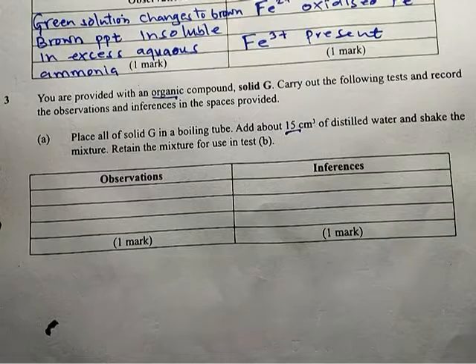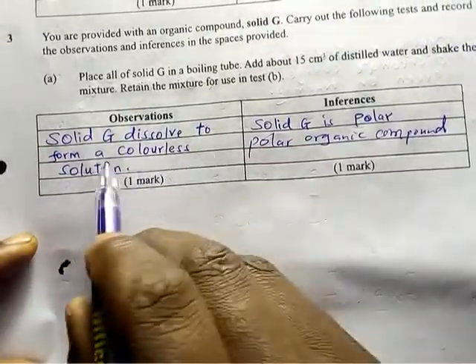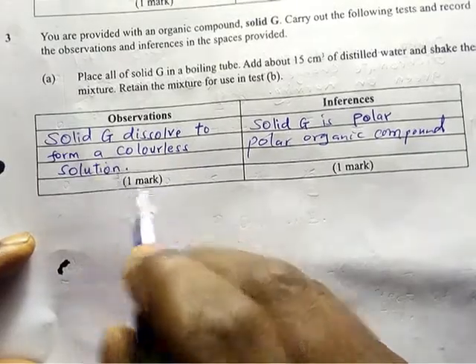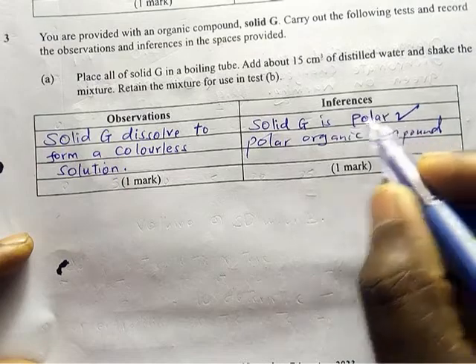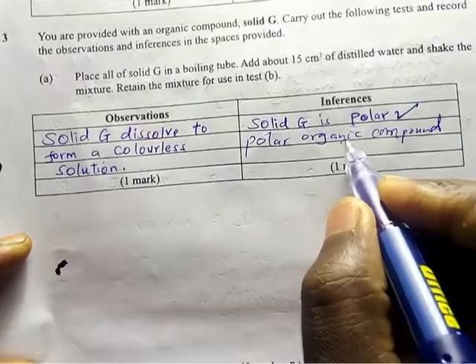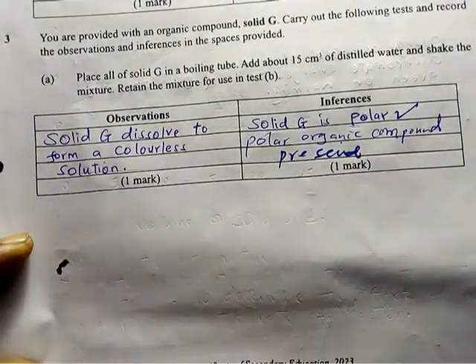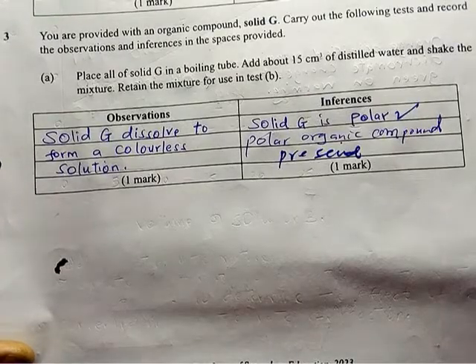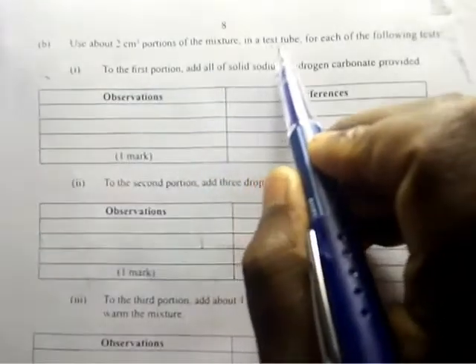Did the solid dissolve or did it not? You need to tell whether the solid dissolved or didn't. In this case, solid G dissolves to form a colorless solution. If it does that, you should know that the solid is polar. The keyword is polar. Solid G is polar, or you simply write: polar organic compound present.